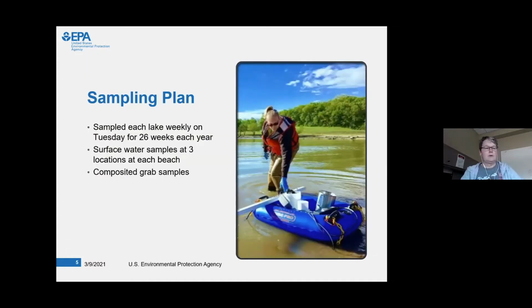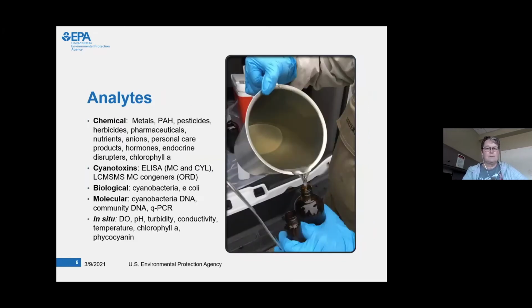Our sampling plan, we were there at the lake each week on Tuesday for 26 weeks for both years, from April to October. We did surface water sample collection, 3 locations at each beach, and then composited those samples and brought them back to the lab.